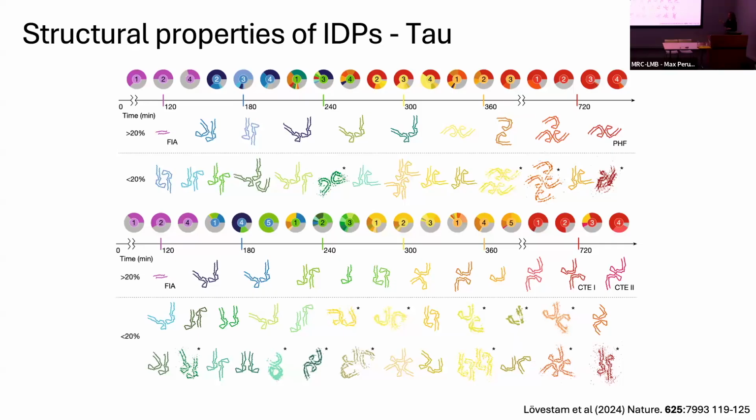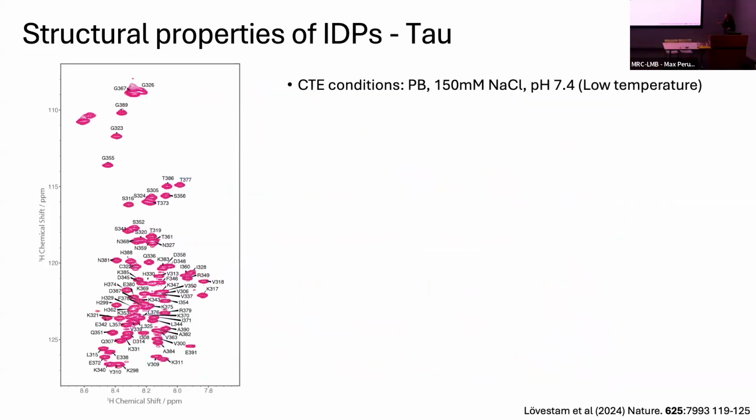She was interested in how tau gets to its final paired helical filament structures, and she did this really beautiful study where she did time-resolved cryo-EM and saw that at the beginning of filamentation, the structures always form this first intermediate amyloid called the FIA, and then over time they mature into the structures that you find in diseased brains. But they are really interested in understanding what it is about monomeric tau that might mean it forms the FIA in the first place.